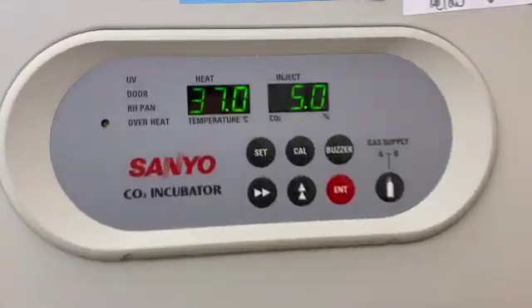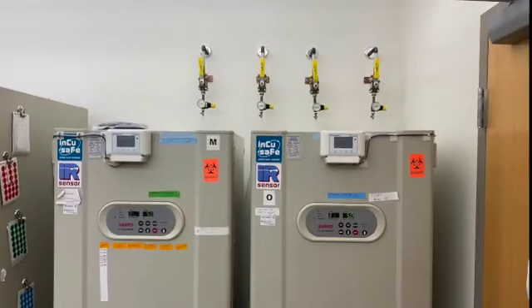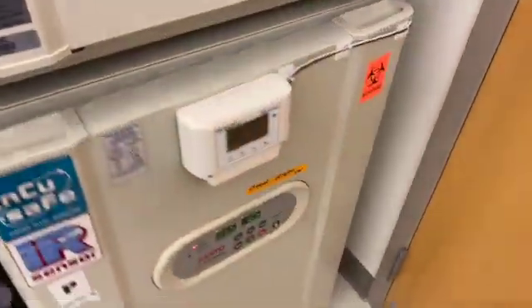Incubators are designed in part to imitate the conditions within the body so that the cells stay alive and continue dividing. Inside an incubator, the temperature is set to 37 degrees Celsius, CO2 tanks provide a 5% CO2 concentration, and a water pan helps maintain a high level of humidity close to saturation. These factors, among others, help the culture stay within a pH range of 7.2 to 7.4.